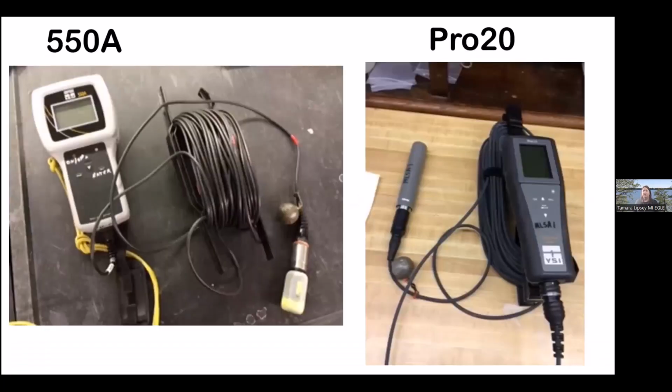This is just some real world examples of each of the meters. You can see the meter. There's the long cable that will go into the water column. On this particular one, which might be for a deep lake, there's a weight to help keep it steady and straight. And this is the actual probe. With the other one, again, here's the cord, and here's the probe right here.